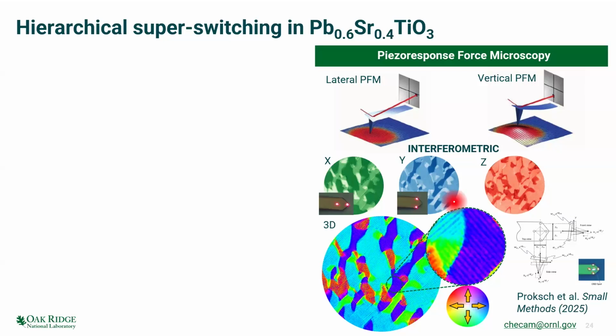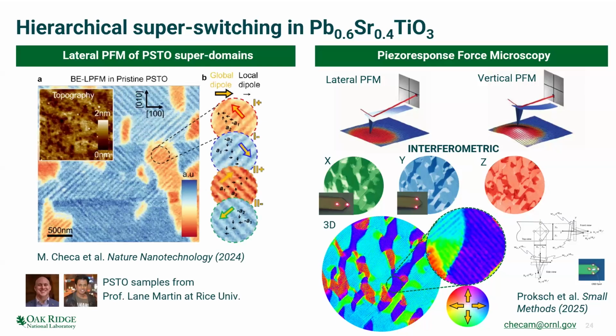Then you do the same with left and right instead of top and bottom. Here you get the Y, and then by averaging the four you get the Z component. So this is good because normally, classically, this has been done through rotating the sample and finding the same spot again. So this allows us to do that without moving the tip and in a quantitative manner.